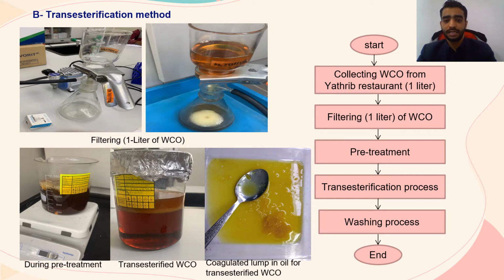This stage is done by heating the 1 liter of filtered waste cooking oil to 220 centigrade for 10 minutes with 60 stir RPM. Then put in 33 gram of ginger with 3 mm thickness to reduce the FFA, which is free fatty acid. Then turn off the hot plate, remove the ginger and leave it for 24 hours.